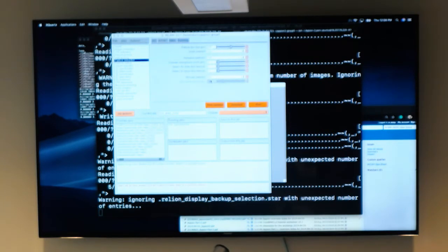You might be lucky in the sense that you're working on a more modest protein, but you can still quite easily collect more data than you may need to process, and you need some criteria to work through it. So be as efficient as you can, and if you unfortunately have to work with your full data set unbinned, then just note that what you're giving up may be time. You may be able to process through it unbinned, but it'll just take longer.